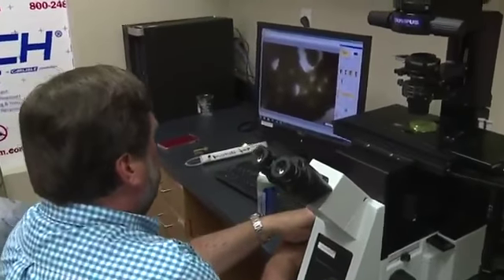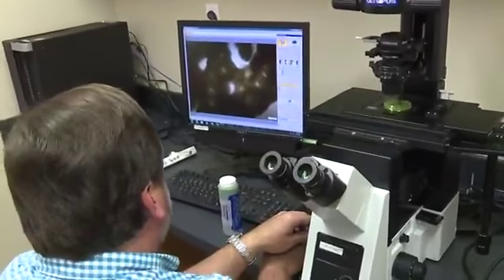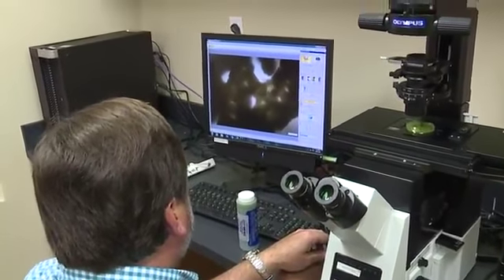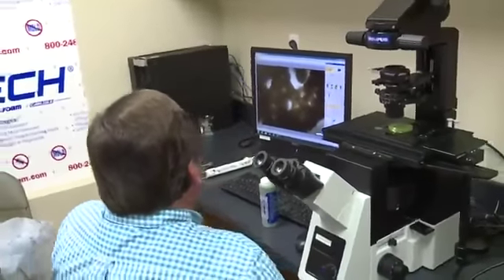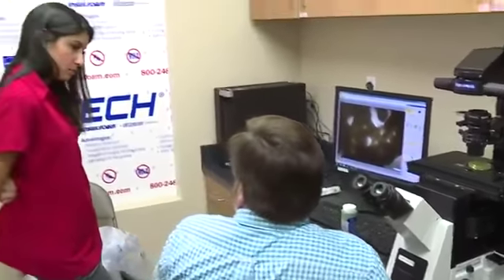And so, let me zoom in a little bit more. So you can see each individual cell right in here. It's moving around a bit. There's like 10, 20, 30, 40, 50 on this side of the ball maybe. By the time you put it all together, you're probably looking at millions of cells in this sample. A lot of the strains of microcystis will produce microcystin, which is a toxin.